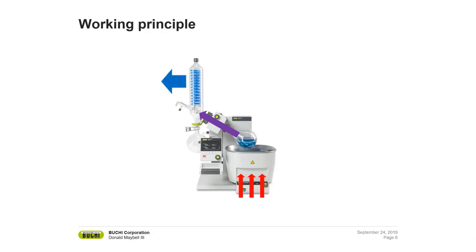And then last would be your condensation. How much energy you put into the system, you must take out as well. Distillation is a two-part process. It consists of evaporation and condensation. If you don't have good adequate condensation, what can happen is any vapors that get past the condenser will go straight into your vacuum source.